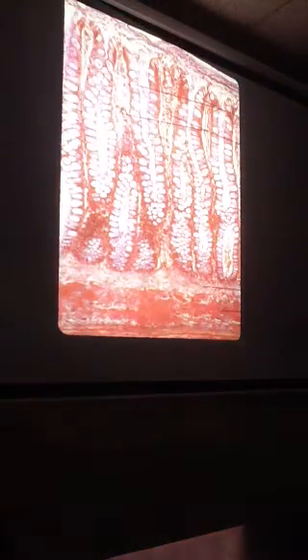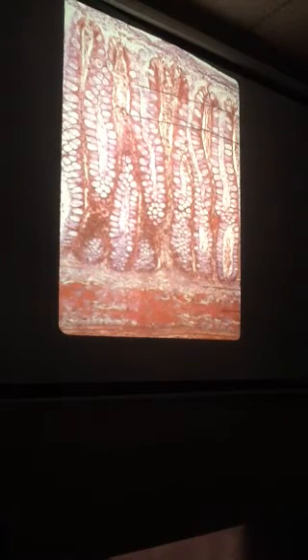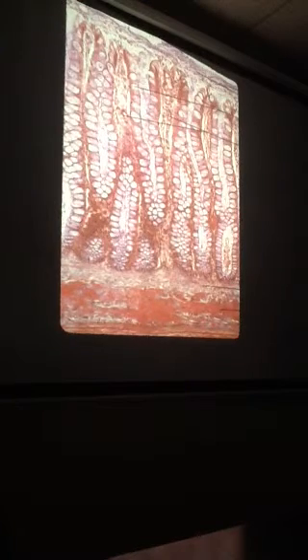Weaning you away. Compartment, higher magnification, but still pretty obvious. Colon. Look at all the bubbles. Colon, high magnification of the colonic wall, with all the goblet cells. It's just one of the greatest slides for goblets.